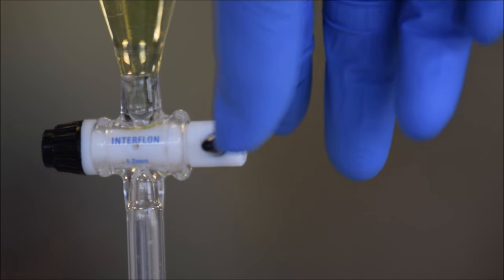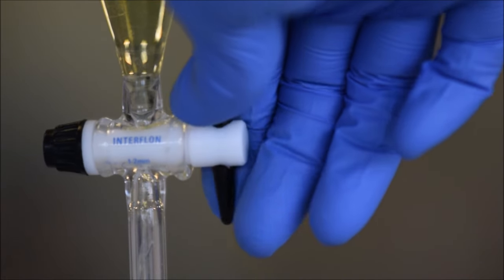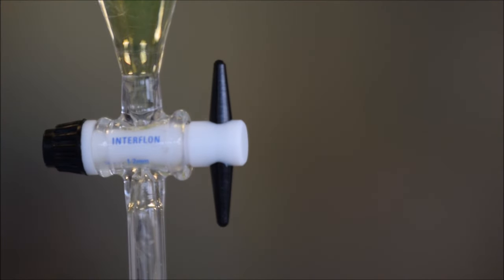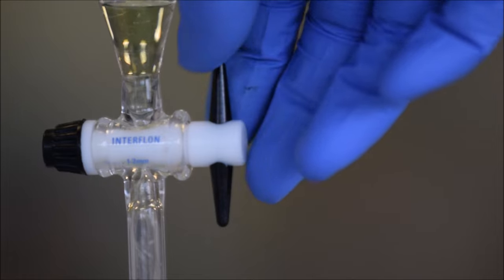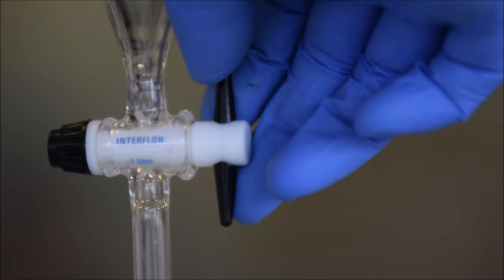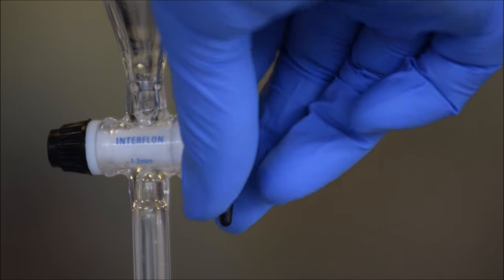You'll see if you look carefully, there's a small hole going through it. And so if we turn it by 90 degrees, the liquid can now flow out. And if we turn it back, you'll once again see the hole is no longer lined up to allow liquid to flow out, and the flow stops. Start, stop. And so that gives us the control to allow the liquid to flow out of the funnel.